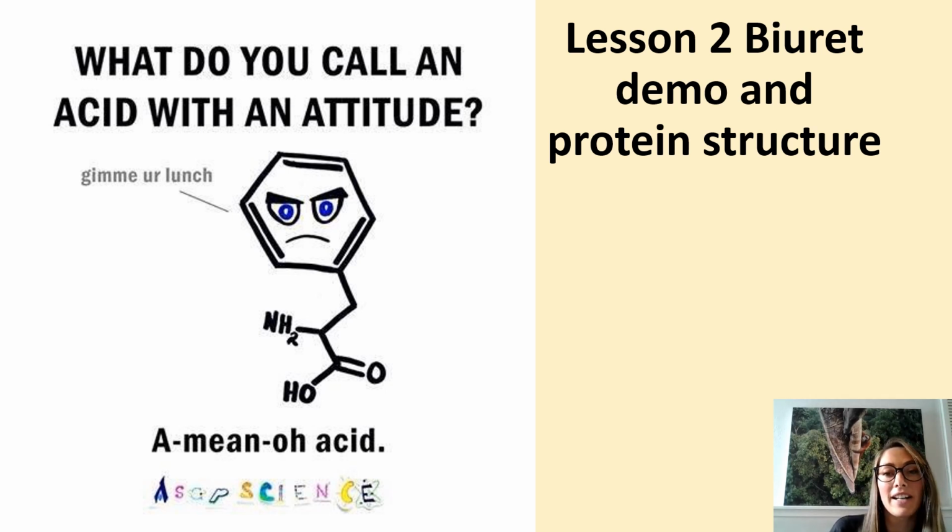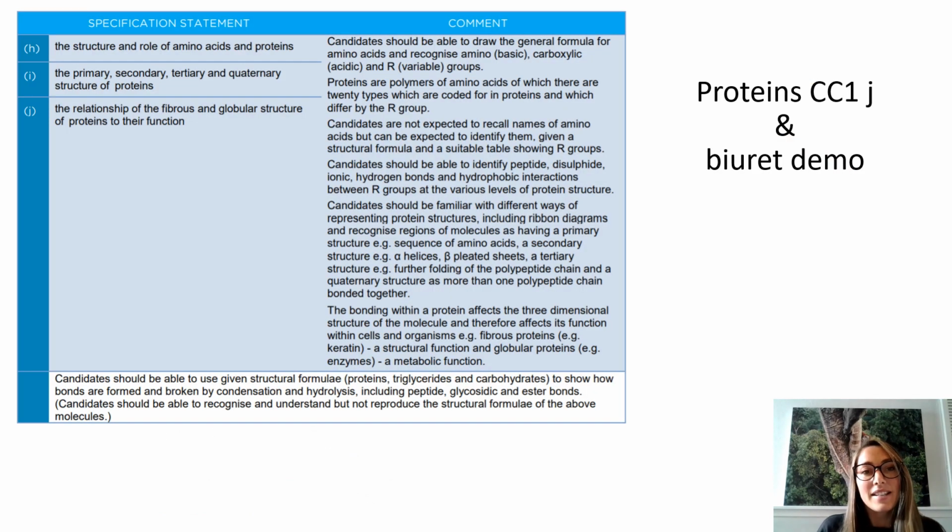Today we're going to be doing the Biuret demo and talking a bit more about protein structure. So we're covering specification point J here.